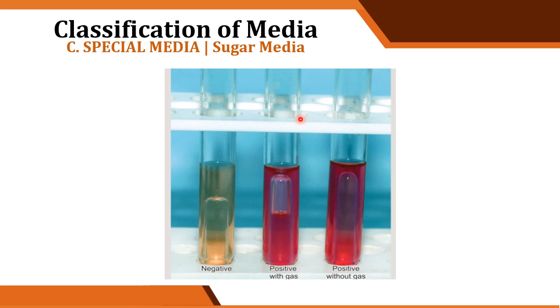Okay, so ang tawag po dun sa tube na nakabaliktad is Durham's tube. Durham's, D-U-R-H-A-M. Okay. So, the medium is originally yellow. So, acid production is indicated by the development of pink color.